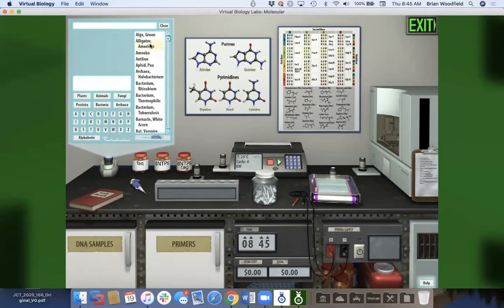All right, so for each of our species in our database, we went to GenBank and we divided the species into groups based on their characters, like plants or mammals, and then different kinds of insects. And we identified a set of genes, sometimes as little as 20 genes, up to maybe 60 genes for mammals. And we created a mini genome for these species based on real gene sequences of a particular set of genes. And then we added random DNA code in between these, and we created these little mini genomes.